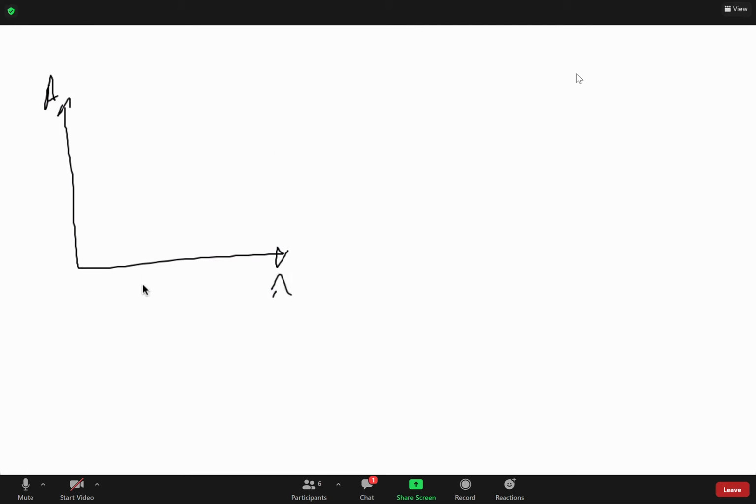Let's say our ethanol is this red spectrum here, and our butanol is this blue spectrum. And I'm actually going to change this so that it is in extinction coefficient units. Well, what's the point? Why are we doing this part of the experiment?